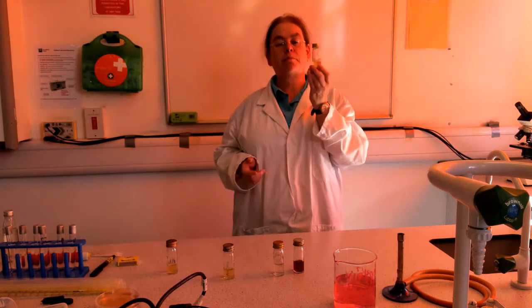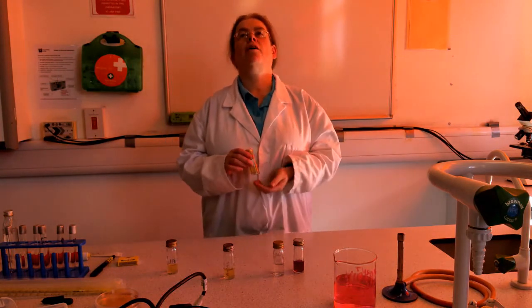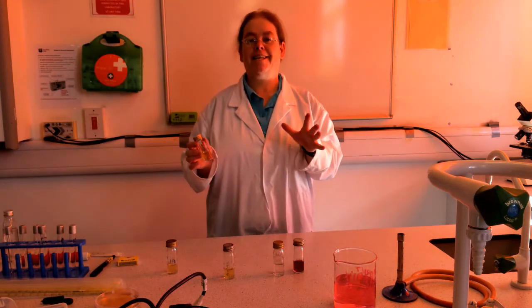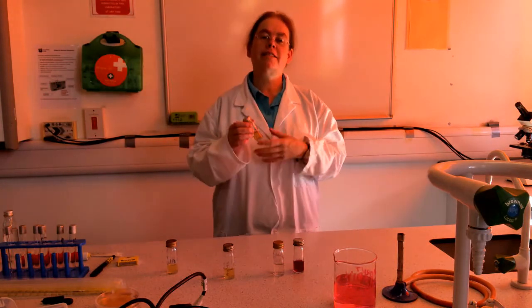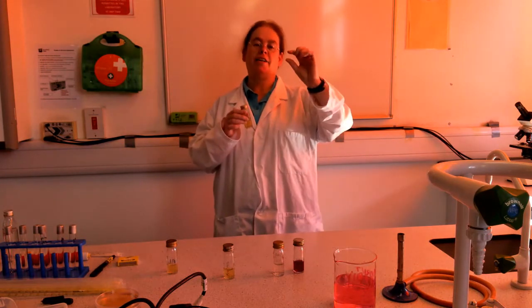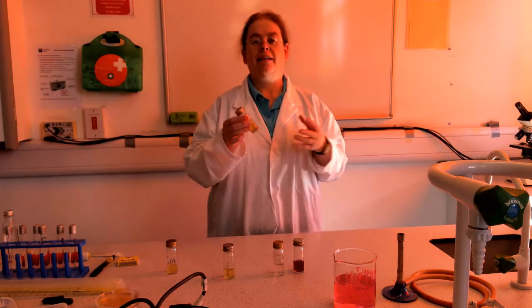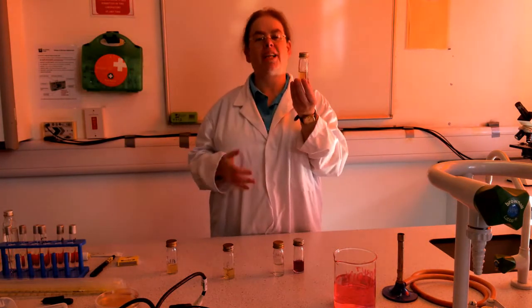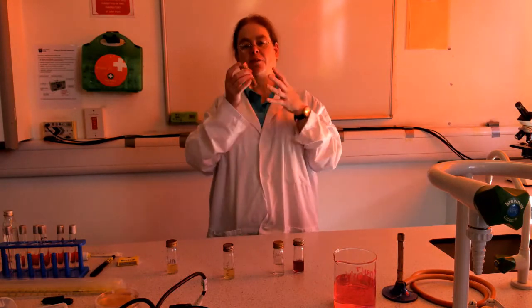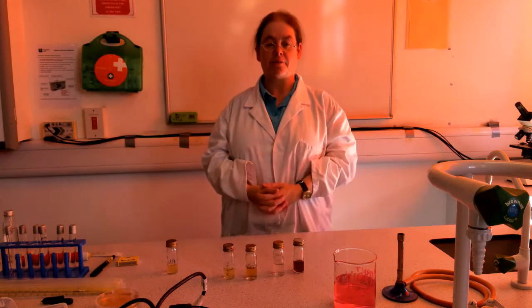The next one is peptone, and that is basically beef stock. You know how in Victorian cookbooks they say, make beef stock, get some beef, boil it for 18 hours. The reason they say boil it for 18 hours is the proteins start to break down into short, what we call peptides. And that's what this is. It's beef that's been boiled so long the proteins are starting to fall apart. It's not even gelatin anymore, it's just little short lengths of amino acid.